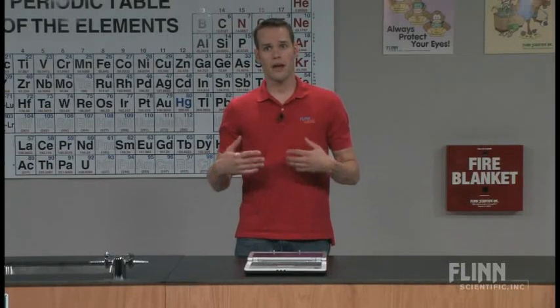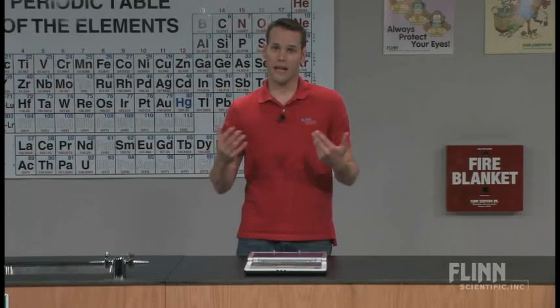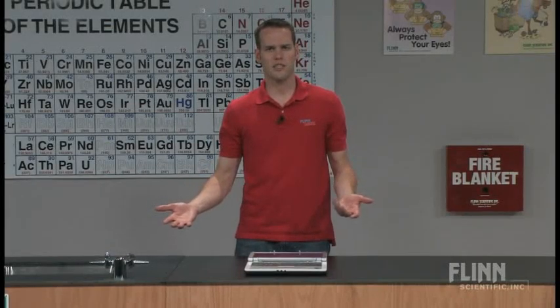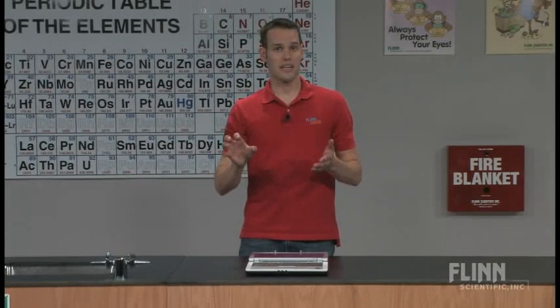I usually demonstrate this for my students by just putting it up on the LCD projector in front of my room so they can see it, or if you have a television, or you can have them huddle around your computer, or even do something like this and hand them CDs to take home as sort of almost a take-home lab kind of experiment. But it's really neat that you can see the data being plotted as you're watching a video of the reaction happening at the same time.